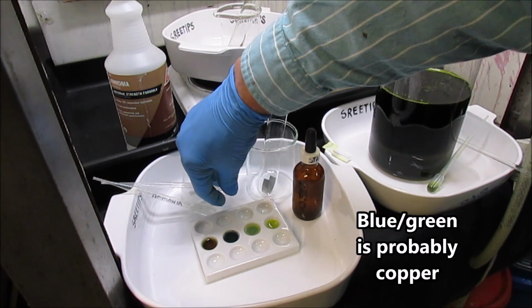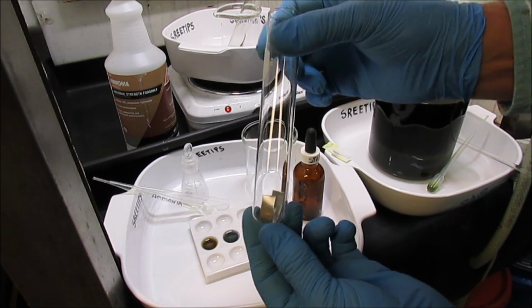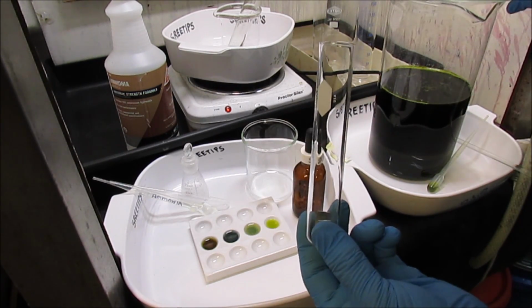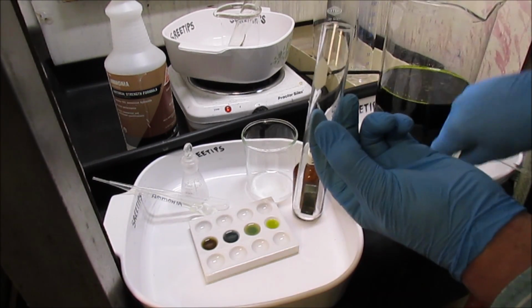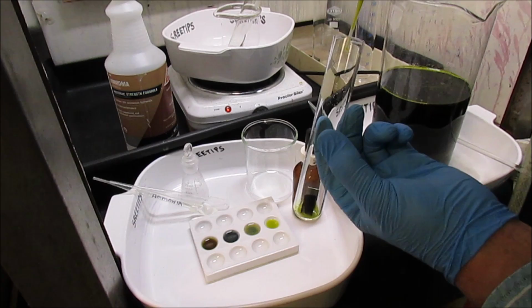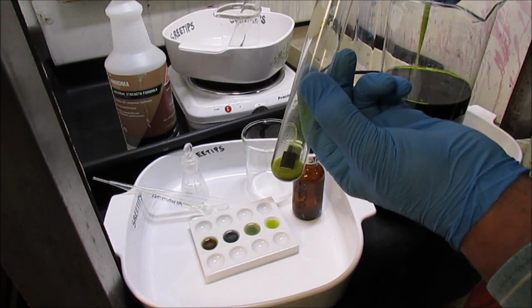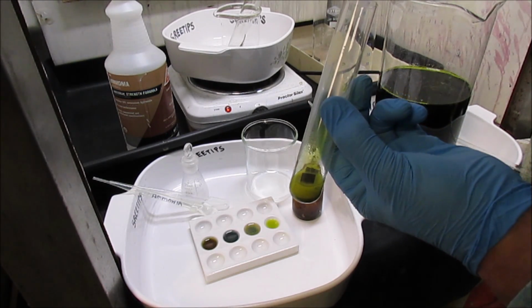And then lastly, I've got a piece of zinc in this tube here. And I'm going to add some of our solution to this. And you can see as soon as the solution hits the zinc, it begins reacting. I'm going to turn my fan on here.